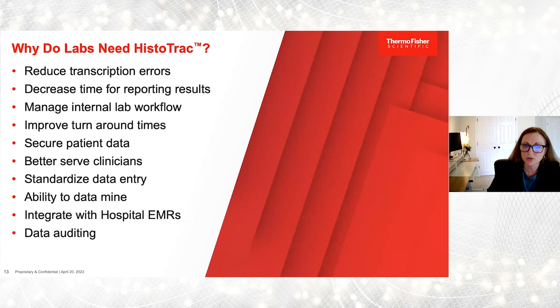So why do labs need HistoTrac? All of these are important, but by having interfaces where you don't have to transcribe the data, you should reduce your transcription errors, which hopefully decreases the time it takes to get your results out and improves your turnaround time. We're able to manage that internal workflow for you, so you can deduce whether you have a problem. Maybe a tech is taking longer to get a result out, or maybe there's a clog in the wheel between when it gets resulted and when it gets reported.